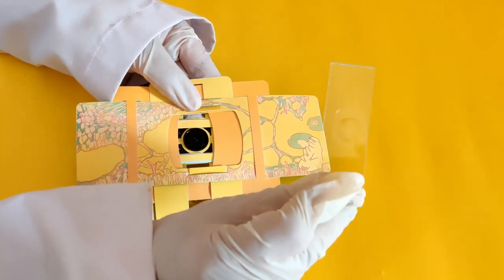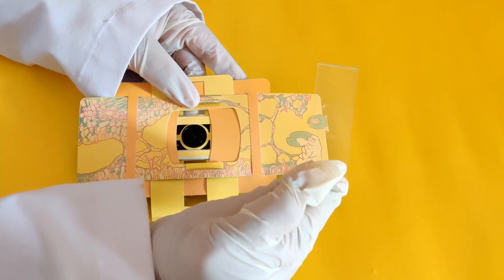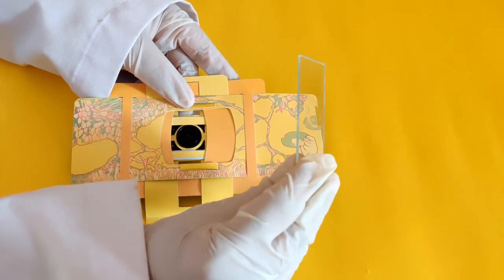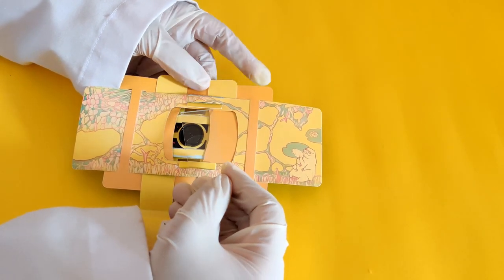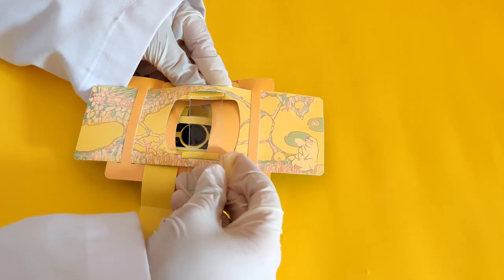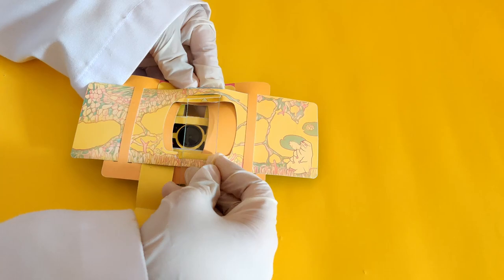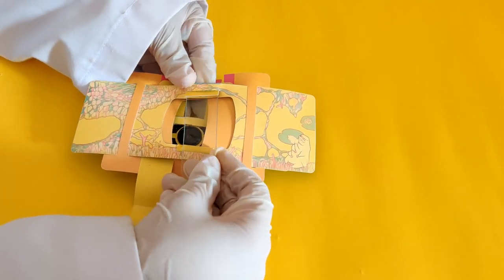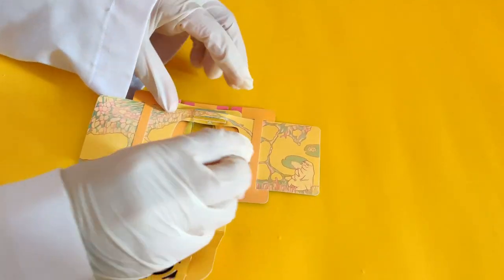Flip the foldscope to the yellow side. Make sure the water sample side of the glass slide is facing the lens in the foldscope. Insert the glass slide into the two slits in the sample stage of the foldscope.